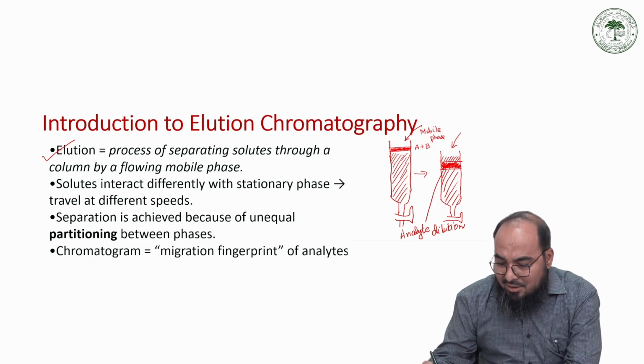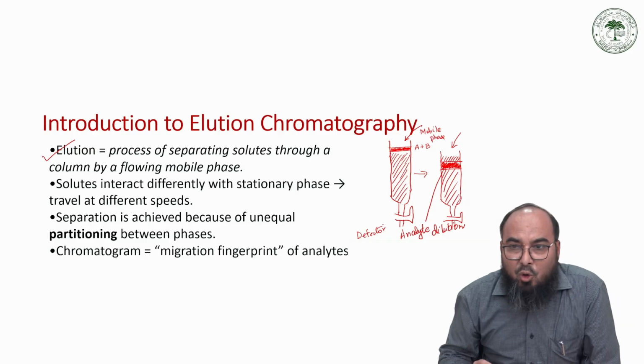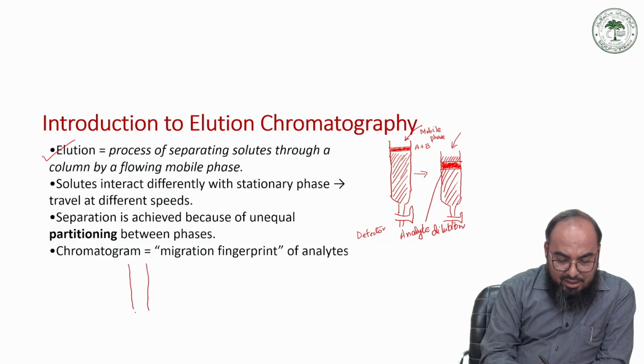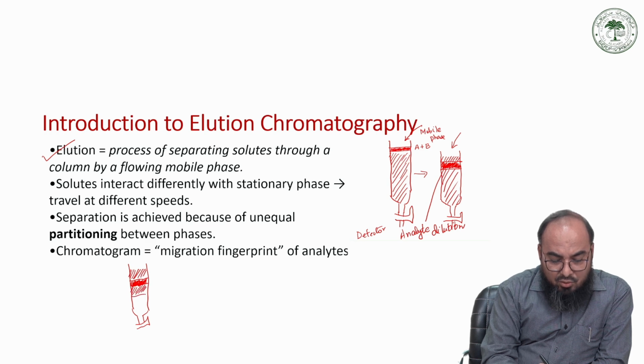This column is also connected to the detector, and as you keep on adding the mobile phase, the band starts separating into its individual components.